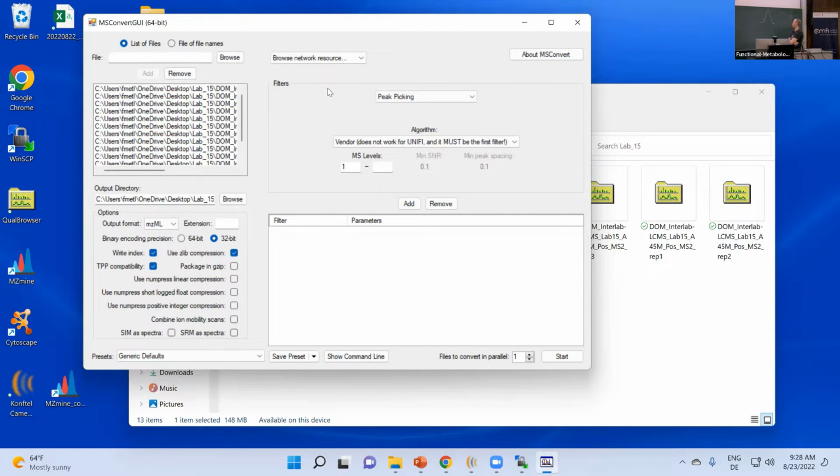So yeah, I think it's not ideal if, instead of picking exactly the middle, it would pick the next highest data point. And another funny thing, I also don't understand why it does that, but if that's the case, it also adds some 0 value data points next to it. That is kind of a warning, which I've seen in the past: some software tools, particularly for peptide spectrum matching, told me that in my mzML files there were 0 intensity features, and I didn't understand where this was coming from. But apparently that is connected to the problem here.